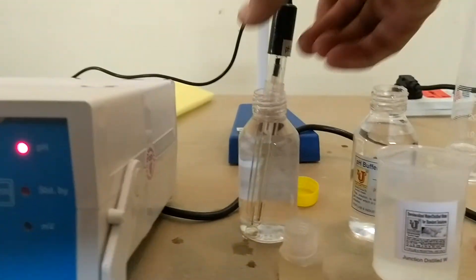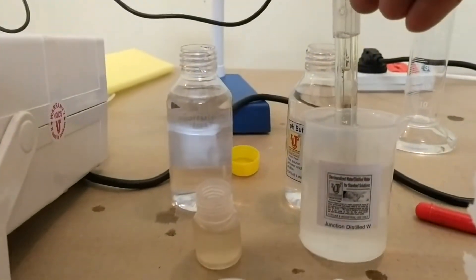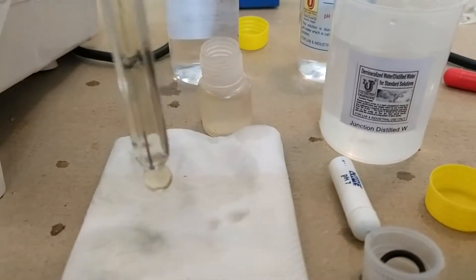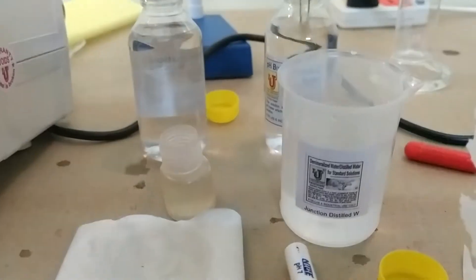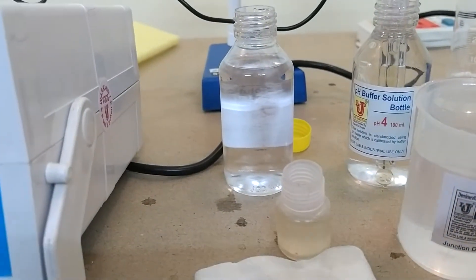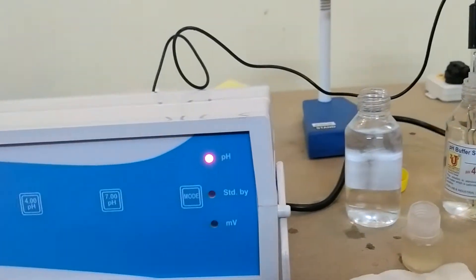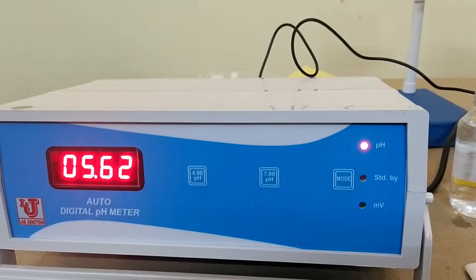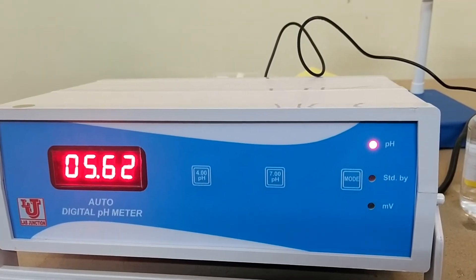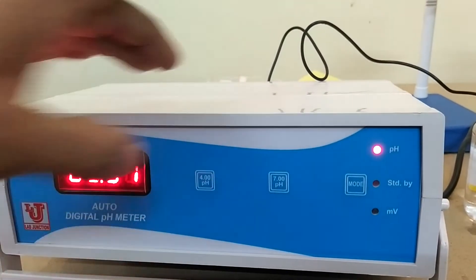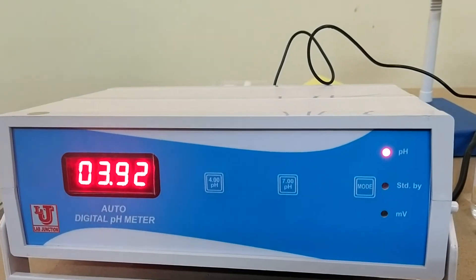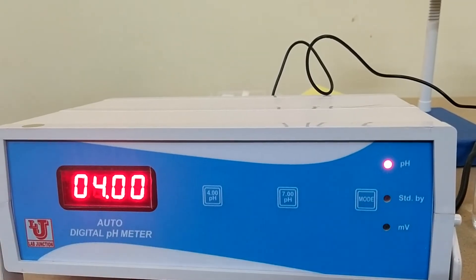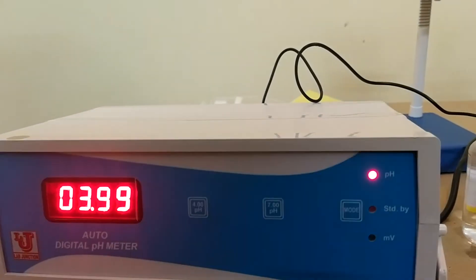Now, refresh electrode with distilled water and put in 4 pH buffer. Press 4. You got it, 4 pH. Now, calibration is done.